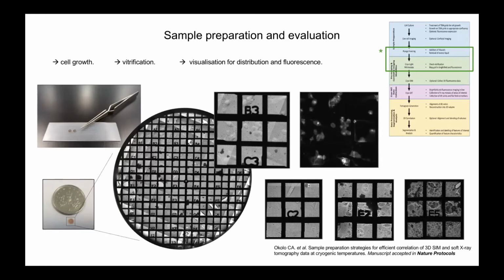It is absolutely vital that the preparation of the sample is done in a good way, because something like this, for example, where you see in the middle of the three a very good distribution, is likely to give you good data. Whereas if it's crowded, like the view on the far right, it's unlikely you collect good data. You get a lot of noise, X-rays will be attenuated. And then if your cells are too sparse, like the one on the left, then it's quite likely that they won't withstand the blotting, because we actually remove some of the liquid, all the process of vitrification. So again, we can help with protocols for all of this, but it is essential that people understand that this is one of the most crucial things in the whole preparation. We cannot give you good data out of bad samples. So you have to start from a good sample.